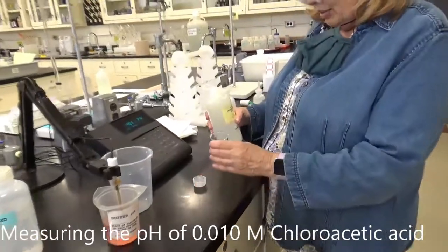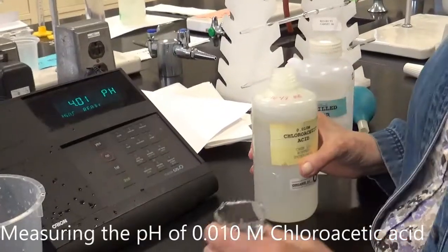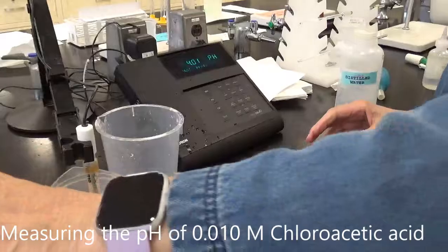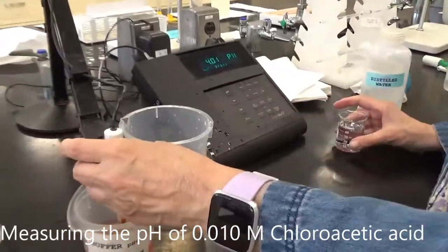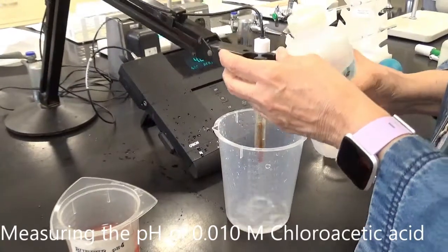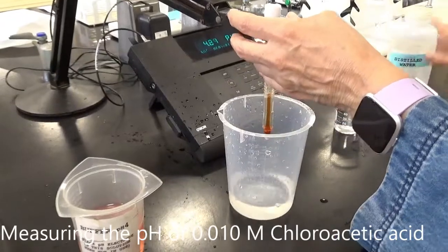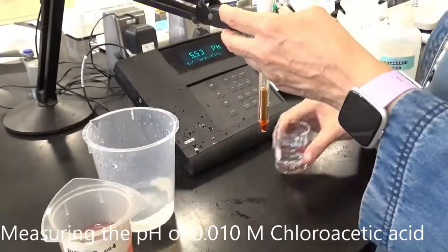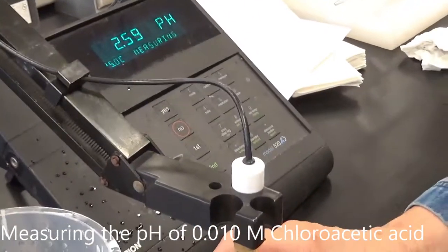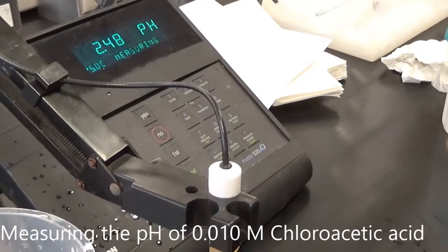So I have 0.010 molar chloroacetic acid, which I have to be pretty careful with. And I'm going to take my pH probe out of the buffer. We'll learn what buffers are pretty soon. Really rinse my electrode because I want to get a good reading. And put it in here. And now you're just going to have to write down the number when we get the beep, when we get the stable value.